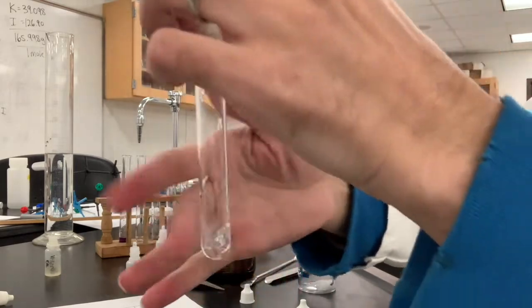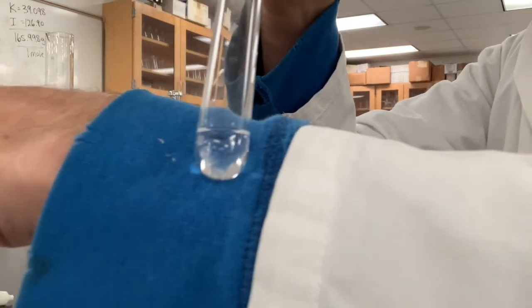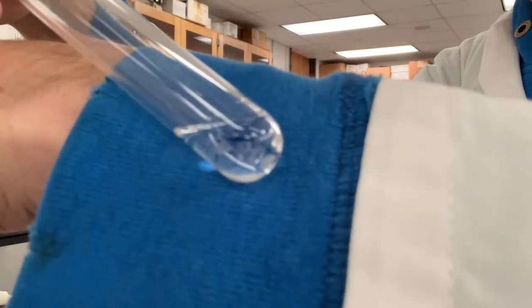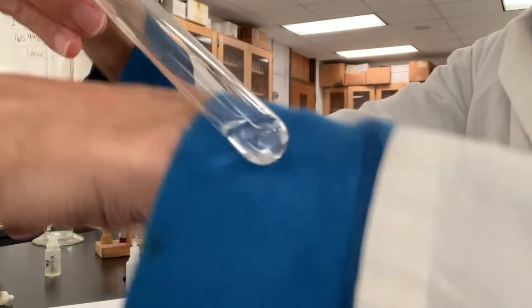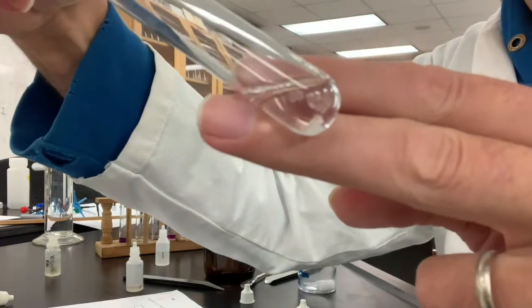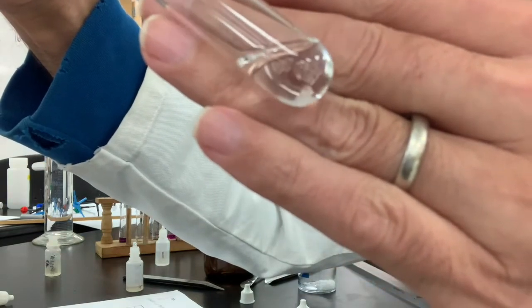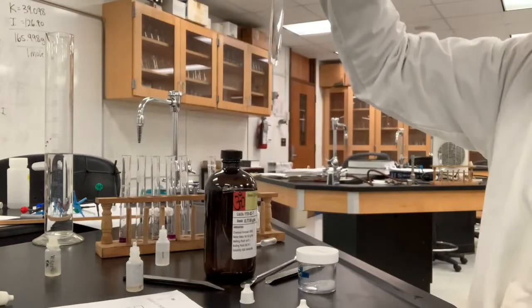And here is cyclohexane and sugar. Kind of having trouble with the light reflecting and the autofocus. Do you see crystals in this test tube or not? See those little things in there? So that's cyclohexane and sugar.